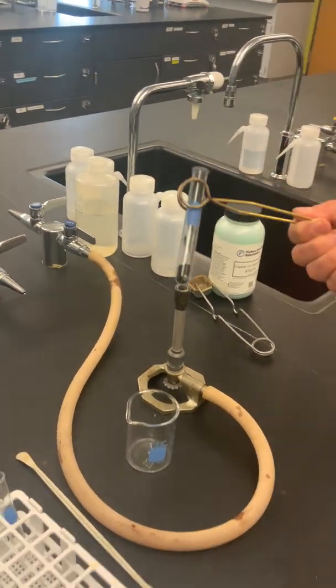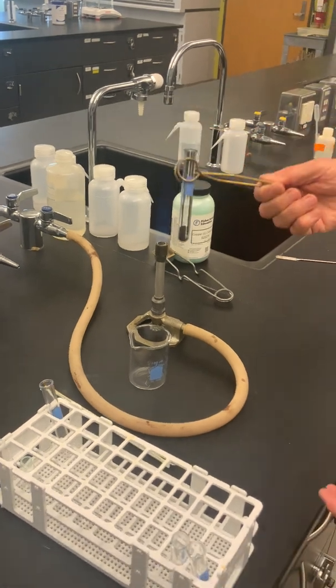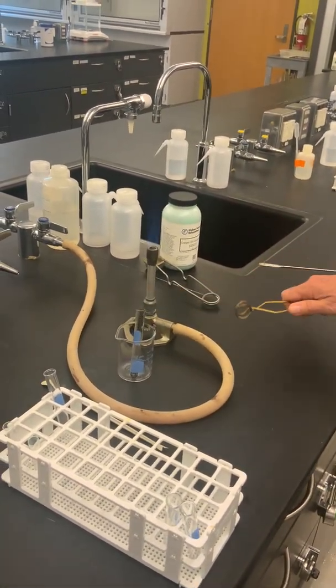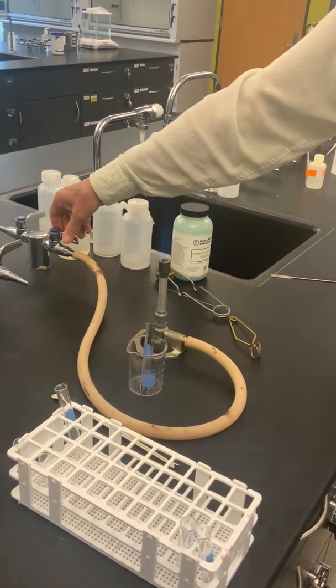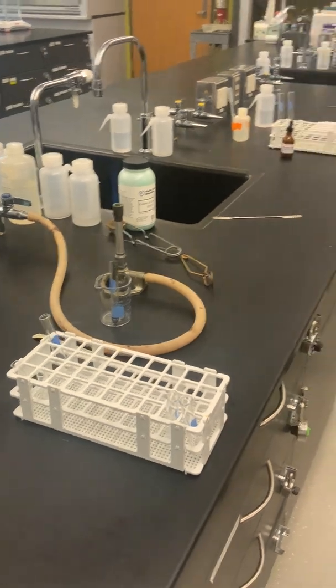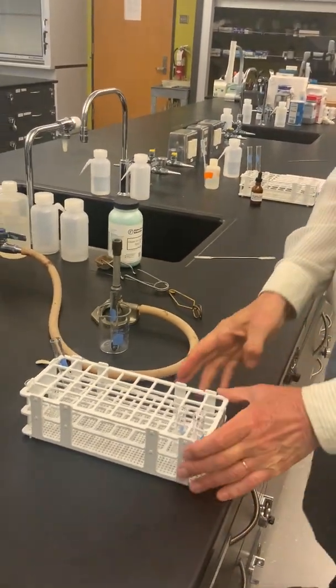Again, oftentimes more than one indication of that chemical reaction. I'll put that in there and let that cool down just a little bit, and then maybe later we can dump that out. Reaction number 3, as I recall, is another decomposition reaction.